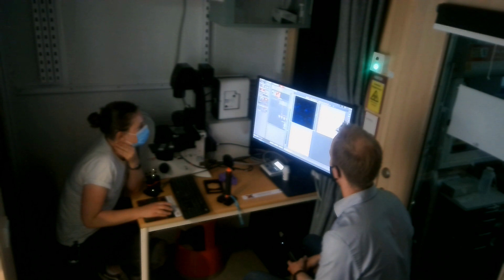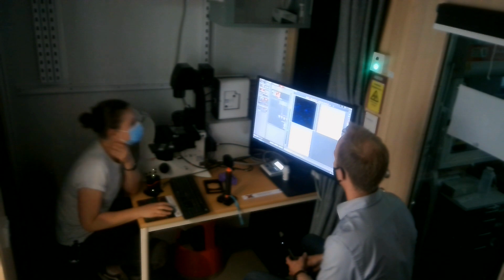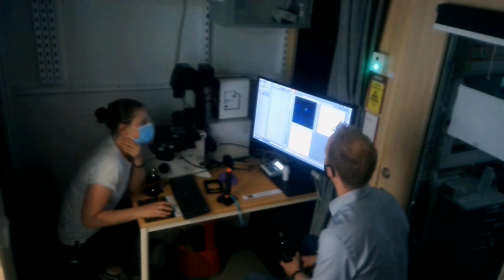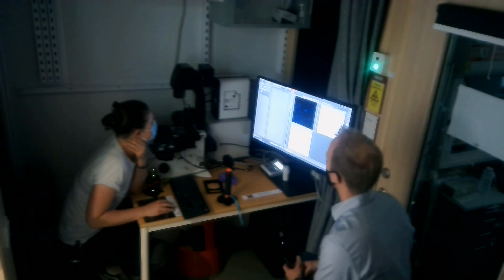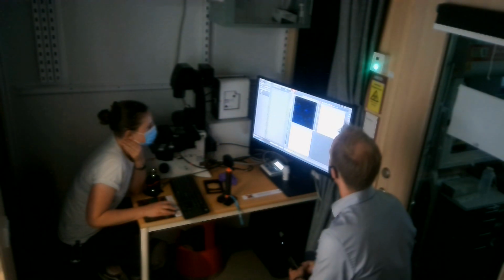Yeah. Can I make an intensity profile with a line, for example? So then, let's see here, you go to Quantify. In Quantify, you have the options up there. You should have Line Profile somewhere there. Yeah, there. And then you pick the line, and you draw a line.